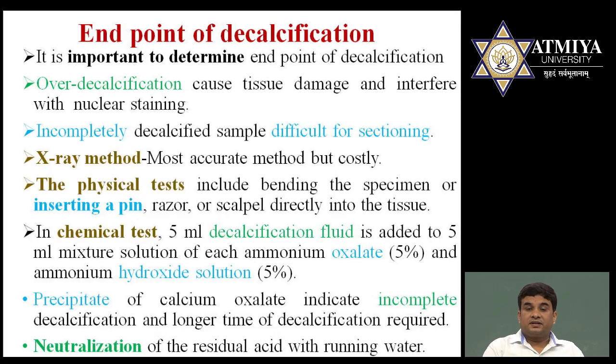There are various methods to determine the end point of decalcification: X-ray, physical, and chemical methods. The X-ray method is very costly, so it is not commonly used, but it gives very good results. Even a single calcium molecule can be identified.